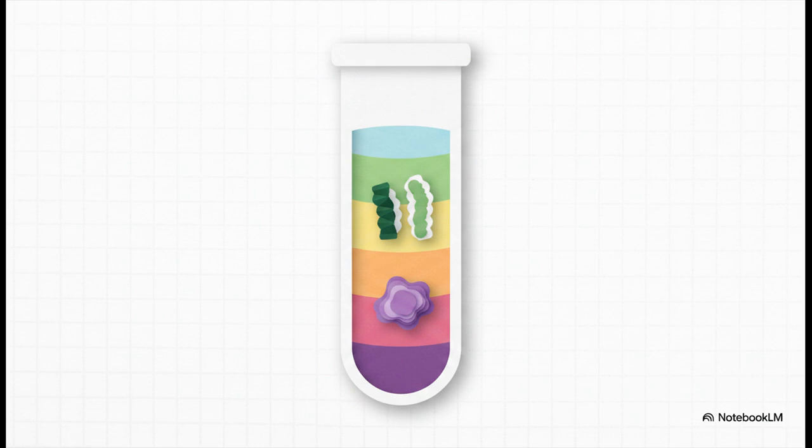gradient until it reaches the exact zone where the liquid's density perfectly matches its own. It essentially acts like a microscopic biological buoy, floating precisely in its specific density zone. This allows us to flawlessly separate mitochondria from lysosomes, even though they weigh the exact same amount.